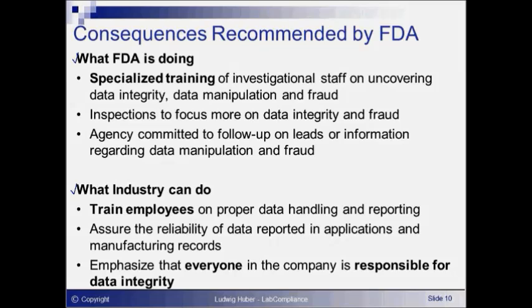Then the next point: FDA was committed to focus more on data integrity. I mean, this is very, very important. The second point is that the FDA agency committed to follow up on leads or information regarding data manipulation and fraud, because in some situations they went to a site and did not find anything in an inspection.